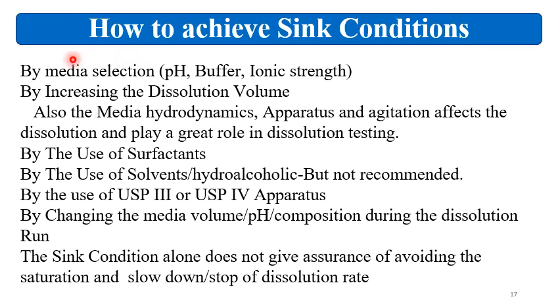Now, how to achieve the sink conditions? If you have a drug which is not giving the sink condition in the generalized media of 500 ml, 900 ml or 1000 ml, then we have to check the media in which the drug substance is having higher solubility and whether that media can give you the sink condition or not. So by media selection, check the effect of pH, buffer, ionic strength. Then by increasing the dissolution volume. Also the media hydrodynamics, apparatus and agitation affect the dissolution and play a great role in the dissolution testing.